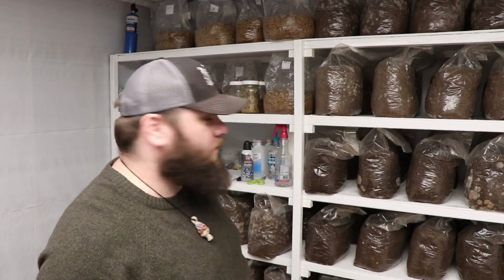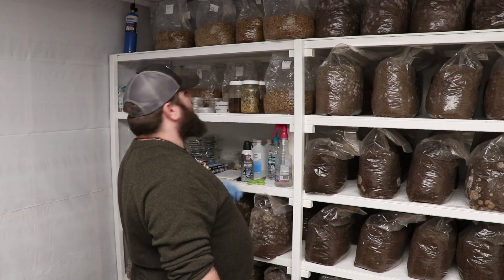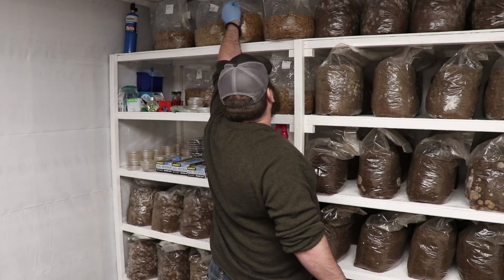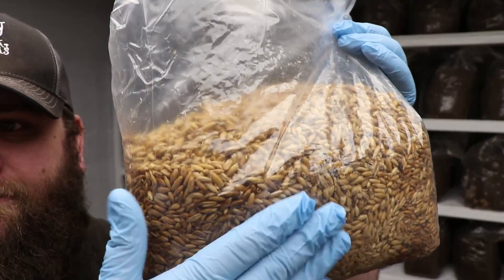It's beautiful. Hey y'all, it's Andrew Reed with Mossy Creek Mushrooms. It's a few days later from what you've been watching, and I just wanted to show you what the liquid culture does once we've got it going. Here is a bag of liquid culture grain spawn that we've made up.